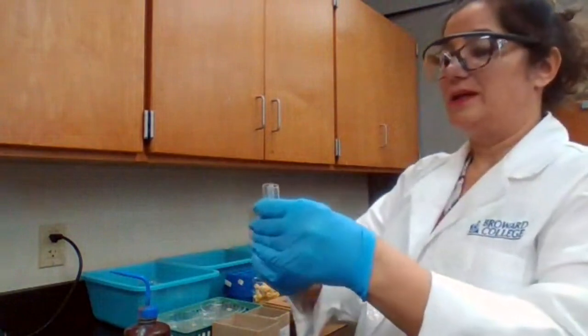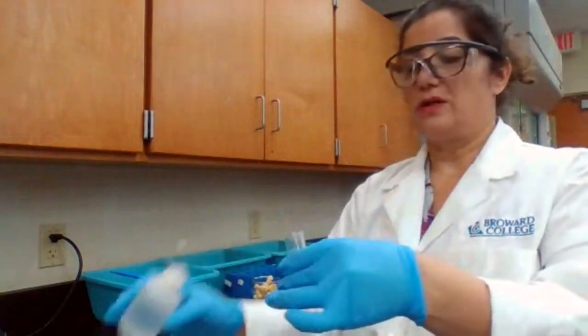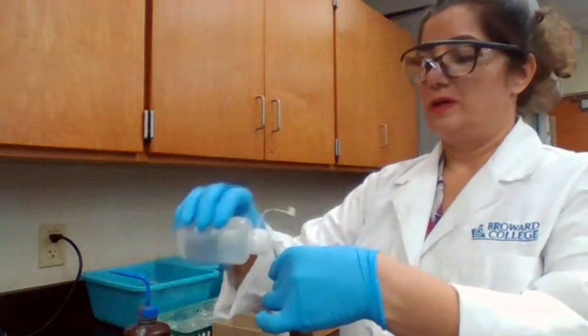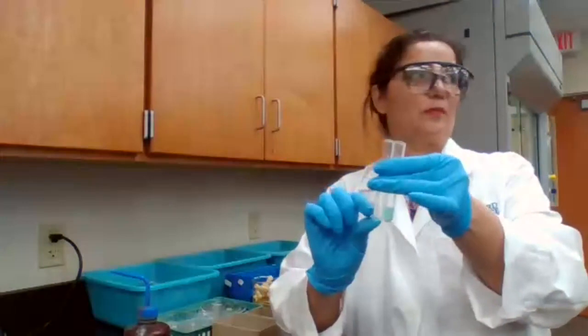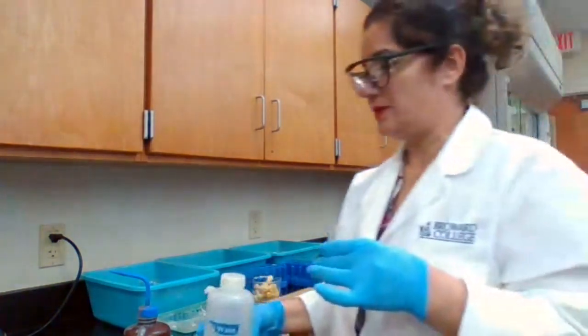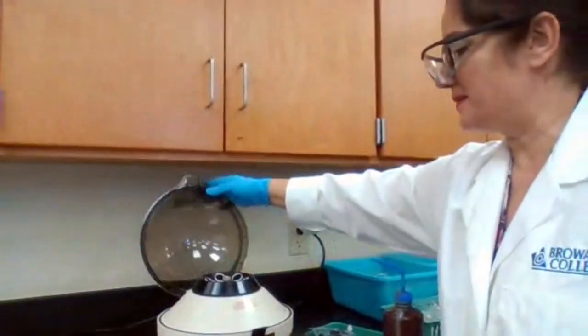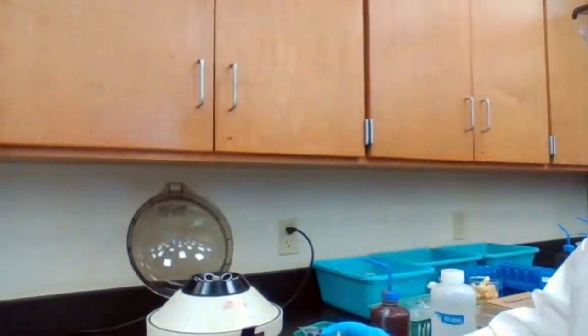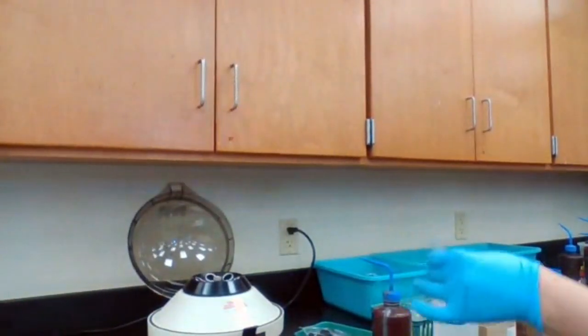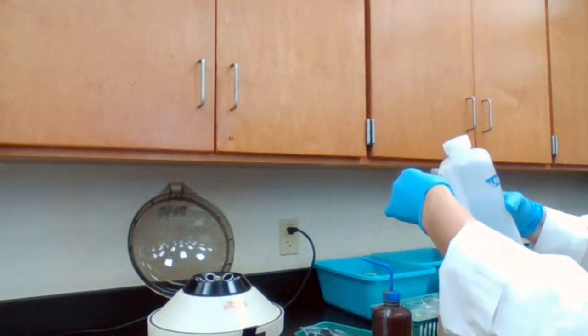Now to this, I'm going to get another test tube. To the other test tube, I'm just adding water. I'm adding water because of the centrifuge. When you watch the safety video for this class, you will see that to set up a centrifuge, you have to make sure it's balanced. So when you balance it, the mass has to be the same.